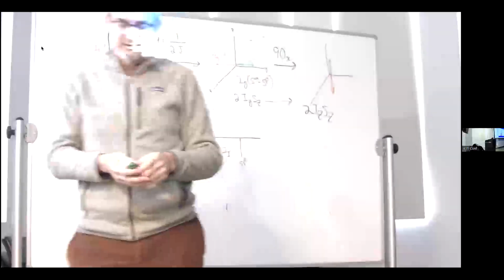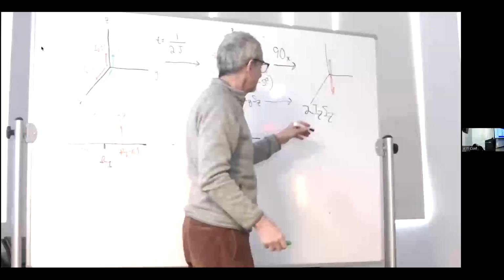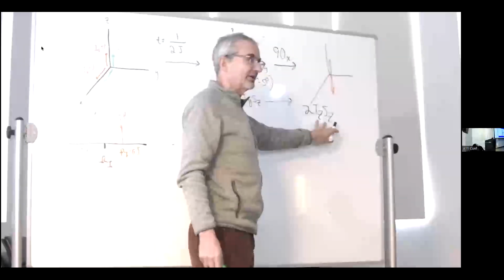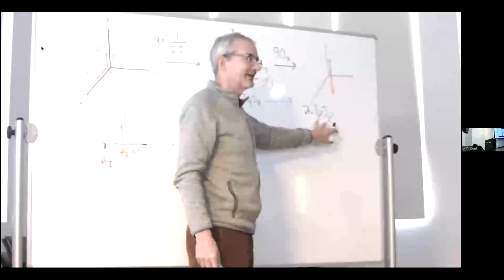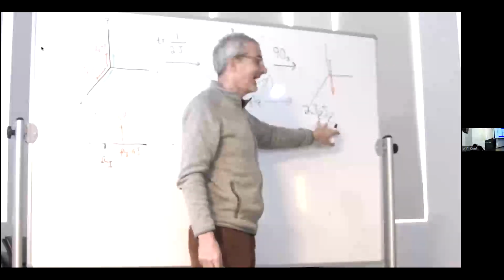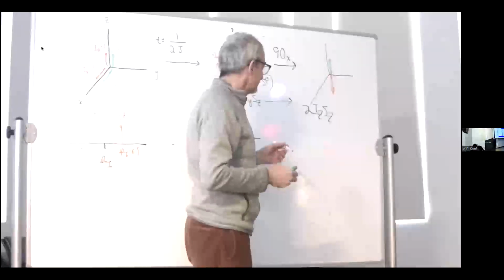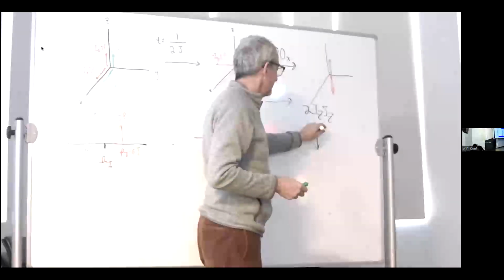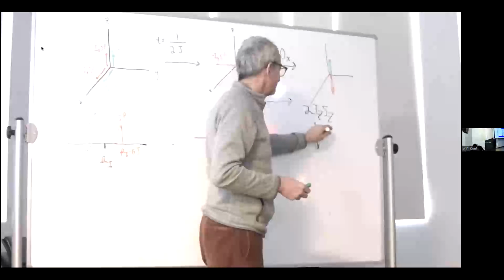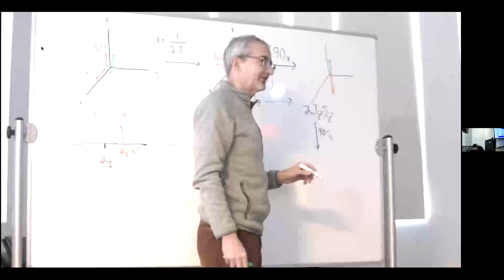So then you might notice that this is completely symmetric in I and S. It's SZ and IZ. And because of that, there's nothing stopping me from now applying a 90-degree S pulse, say with X phase.